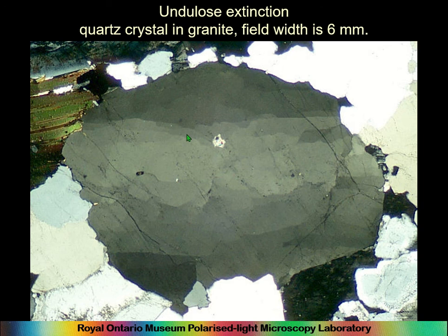So it's sort of like twinning, only it's not. It's just sort of starting to fall apart. Eventually, with further stress, these will form into different crystals of quartz. Like this is a different crystal of quartz here. But right now, it's just forming this undulose extinction. And so what this means is that parts of it will be close to extinct and parts of it won't. So you can have degrees of undulosity, which are described in the handbook.